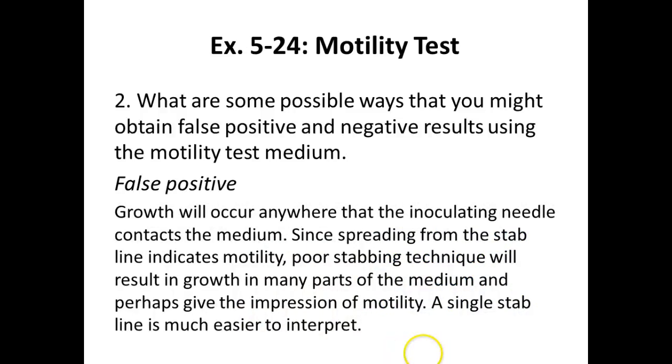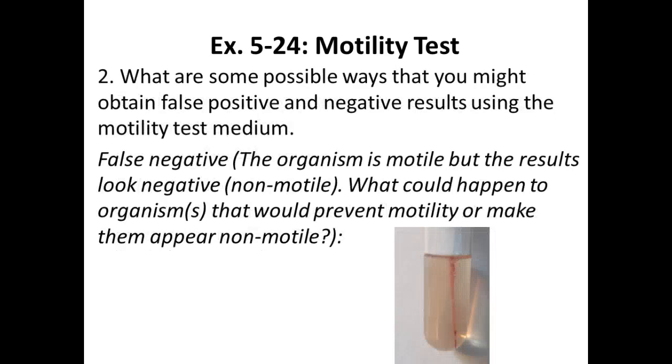And again, anywhere the organisms are, it's going to turn red. So what about negative, right? So here's an example, right, of what might be a false negative. This is where it looks negative, right? You think it looks negative?